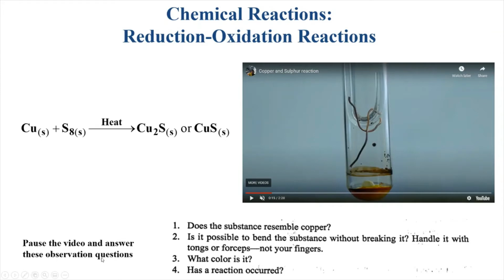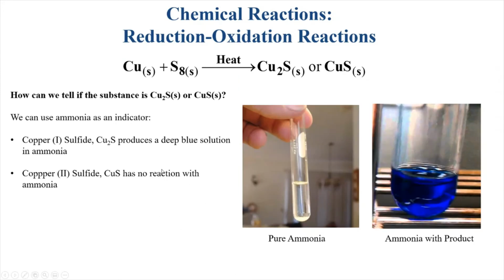Okay, so you can pause the video now and answer those questions before we move on to the next. Now, there's another set of questions that we have to cover, and that is, how can we tell if the substance is copper 1 sulfide or copper 2 sulfide?